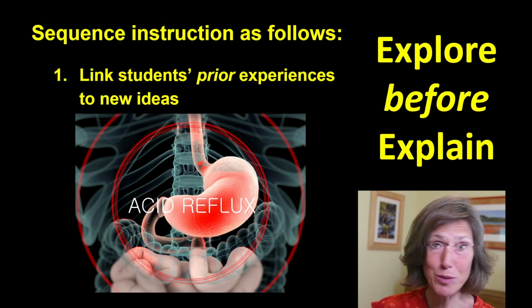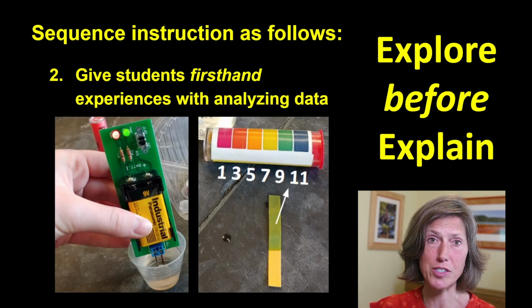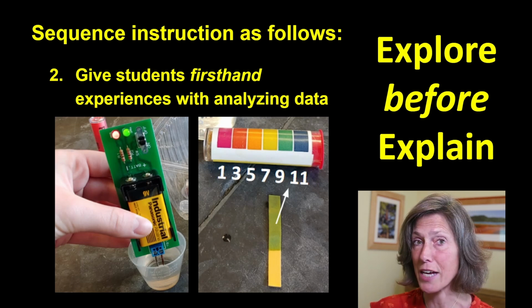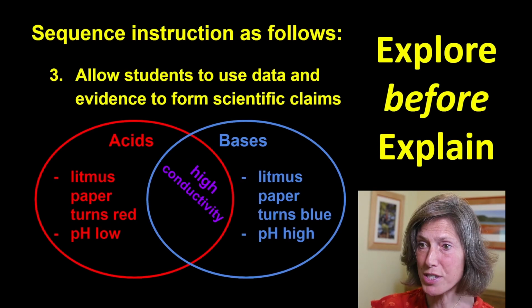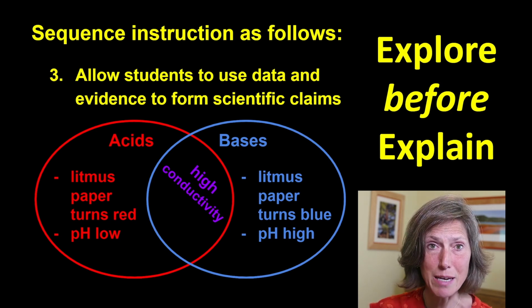Who doesn't know about stomach acid? Second, I gave my students first-hand experiences with analyzing data, including conductivity and pH paper data. Third, I allowed them to use that data and evidence to form scientific claims.